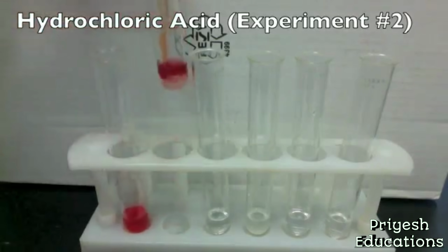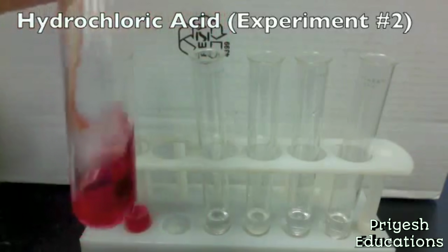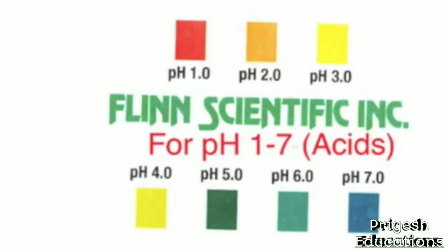When testing it a second time, using universal indicator solution for pHs 1 to 7, we can see it's a bright red color. According to our second chart, that corresponds to a pH of 1.